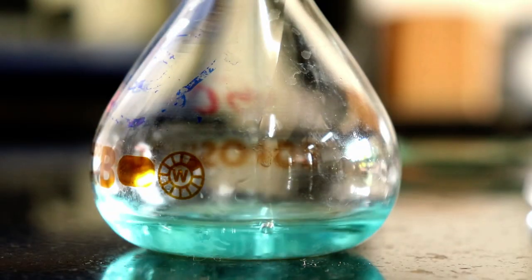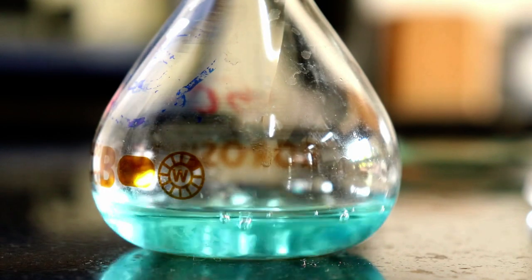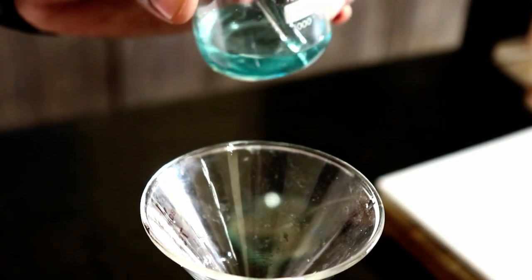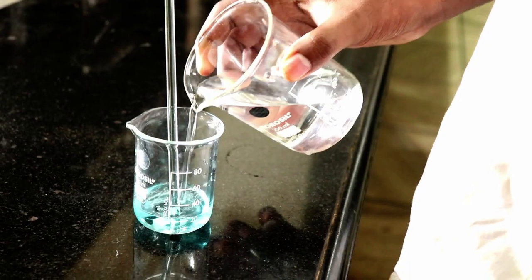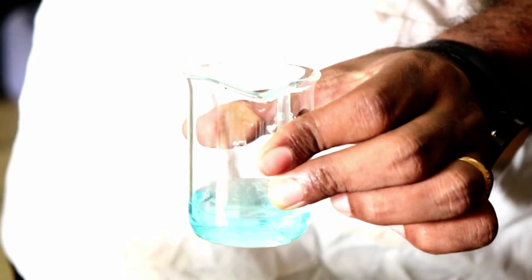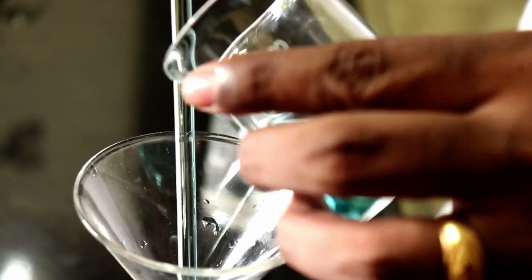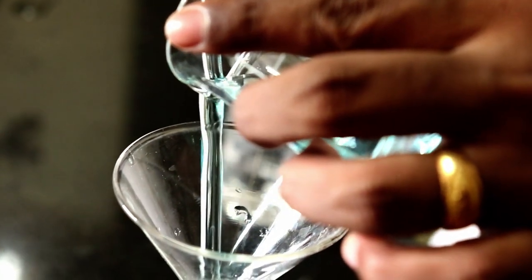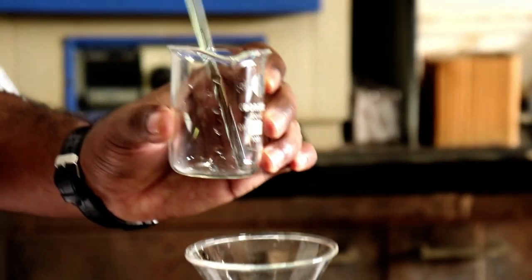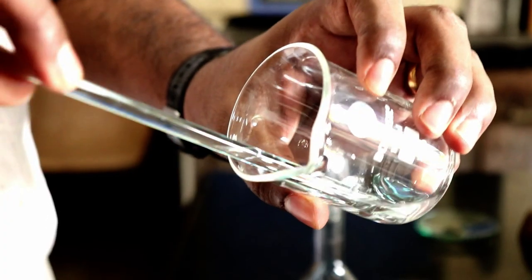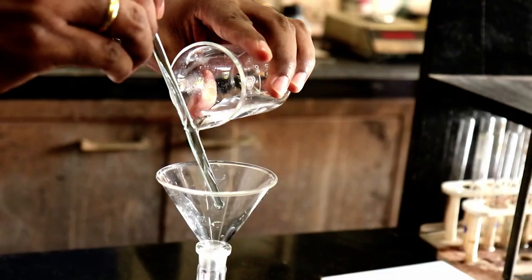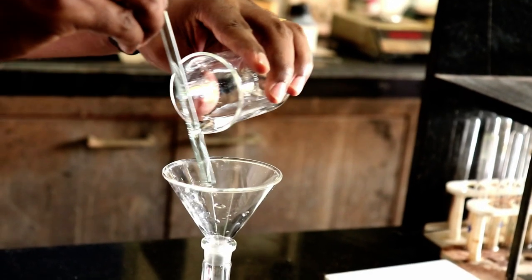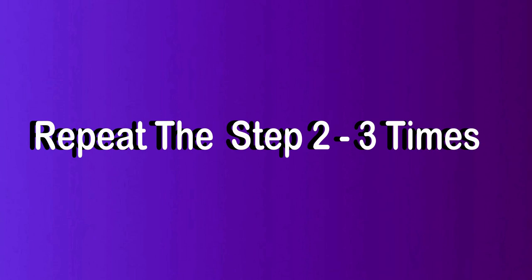Carefully put the glass rod back into the beaker. Keep this much amount of liquid, add little extra water to it and stir. Pour this solution into the standard measuring flask. The glass rod still has some solution onto it. Pour some water into the beaker and stir it. Repeat these steps 2-3 times.